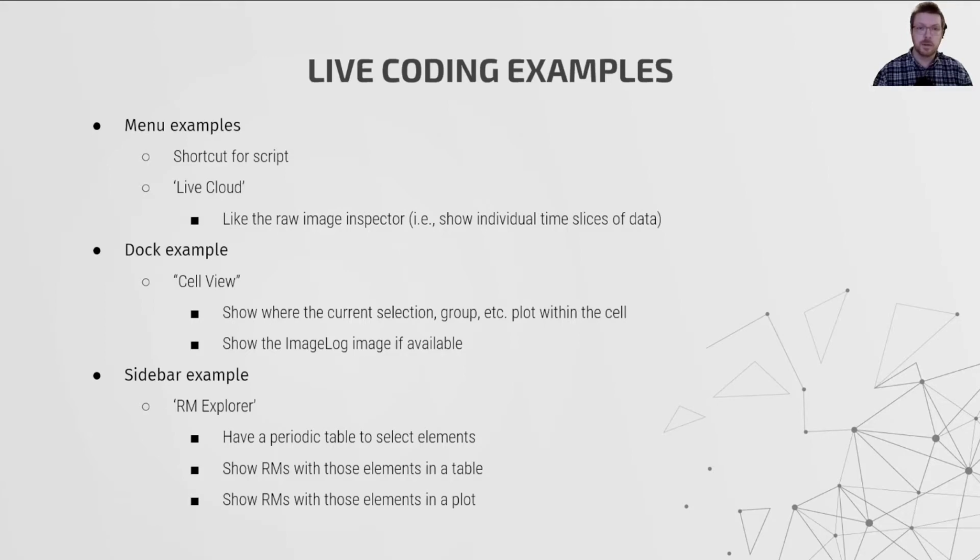And then lastly, we'll create a sidebar example where we'll use a periodic table to select some elements, and then we'll display some reference material data for reference materials that match the selected elements. Okay, so let's get started.